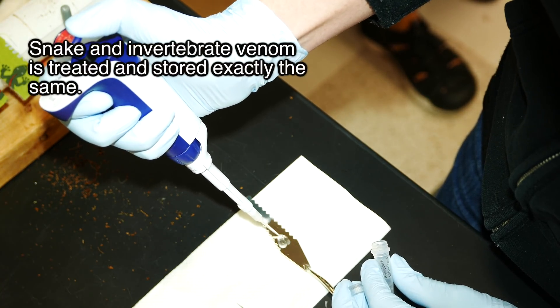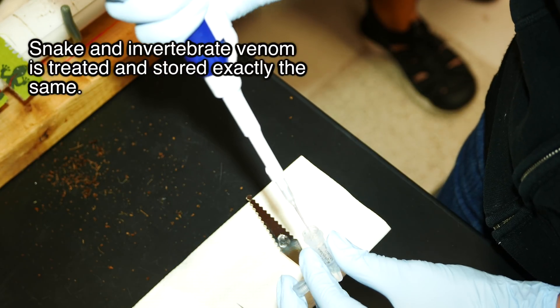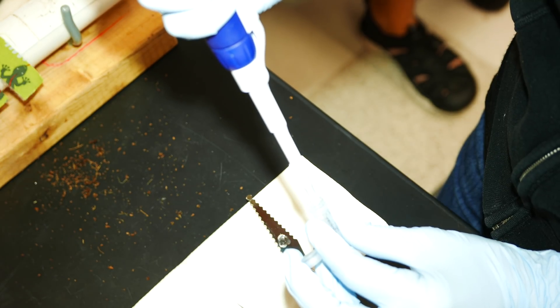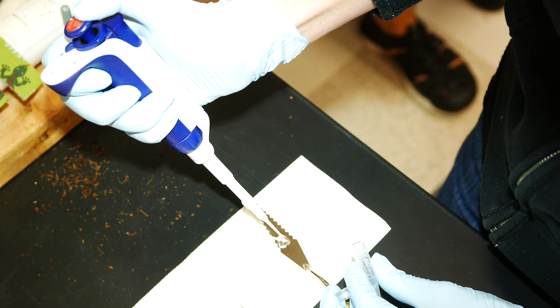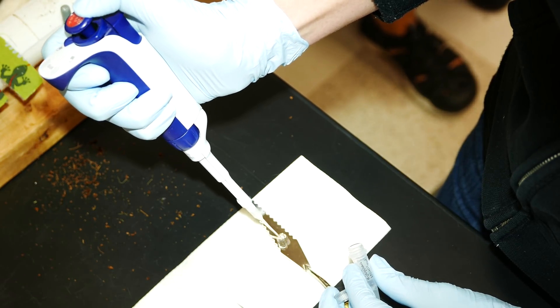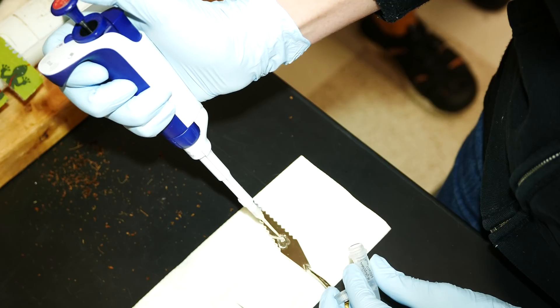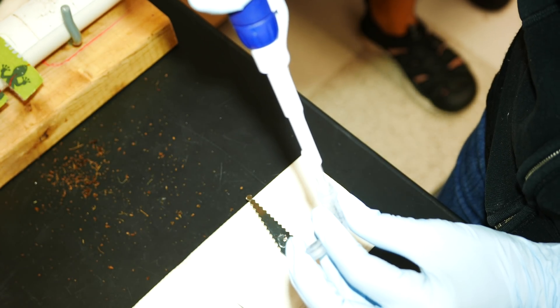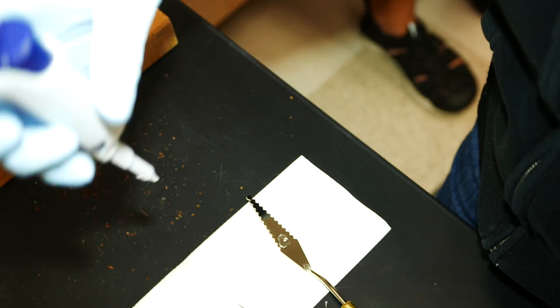I think it'd be kind of fun to try getting one of the glass pipettes over the tail and then it's kind of shocking you. This seems pretty easy — it's really nice when you can see it. Pretty good yield, so I don't have to worry about it.